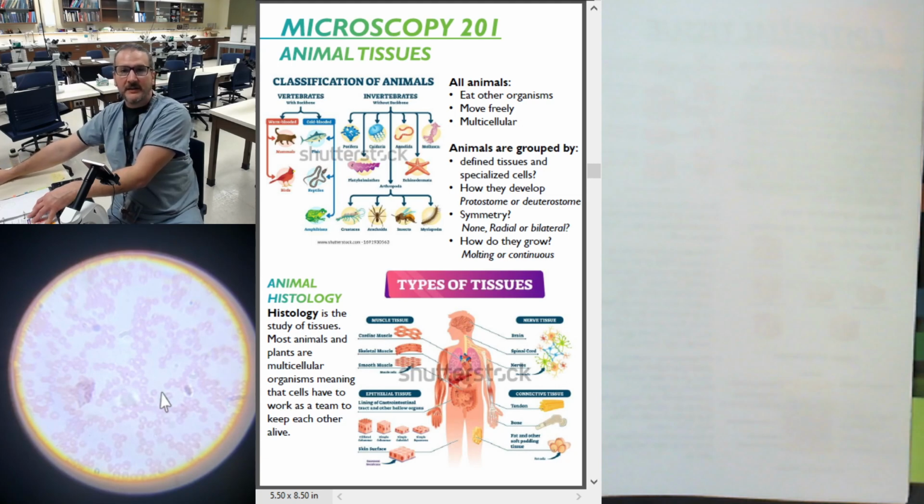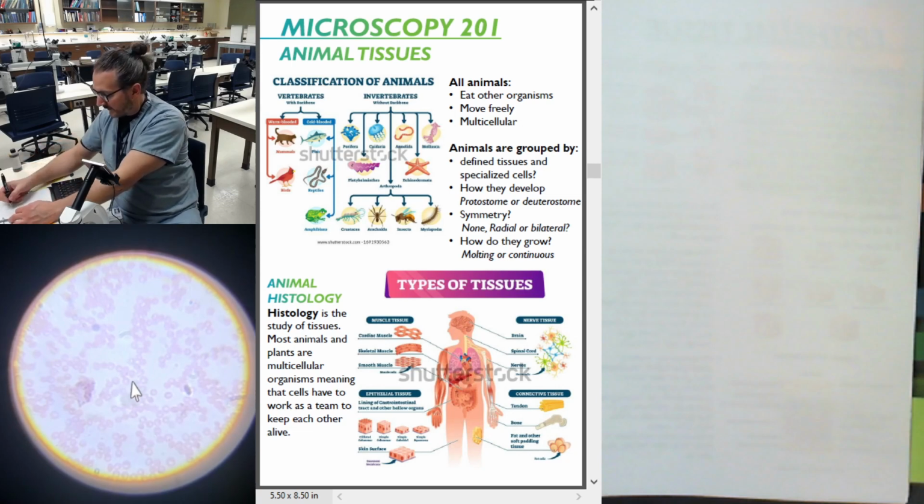And this is as high as you can get with the 10x magnification from the ocular lens. But if you can get your 20 in and do the same thing, you have 800 times magnification, so twice as close. You'll actually see that all these ones that look like they're solid are actually kind of caved in, just like this, because a red blood cell, if I sliced across it, is bent here, bent here. It's biconcave. It caves in here.